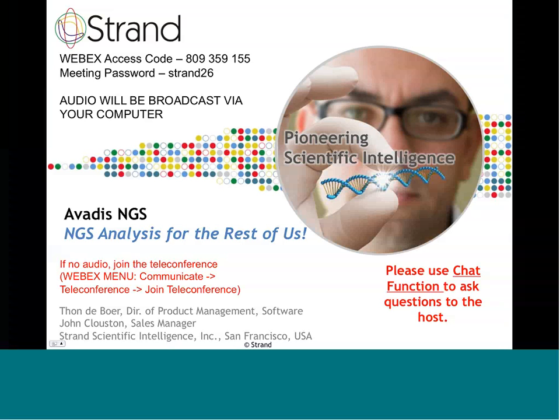And the topic today is the general introduction to the Avadis NGS Analysis software system. And the goal of the seminar is to provide you with enough information about each of the three main NGS workflows so that it's easier for you to decide to investigate the software further. And we'll take you through the three workflows and also take you into the biological context.